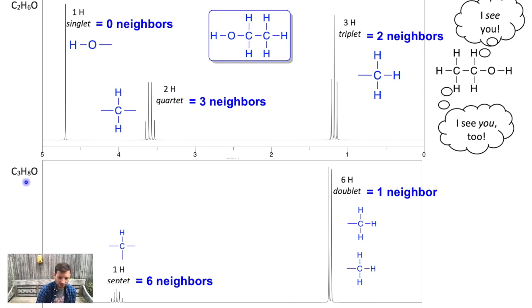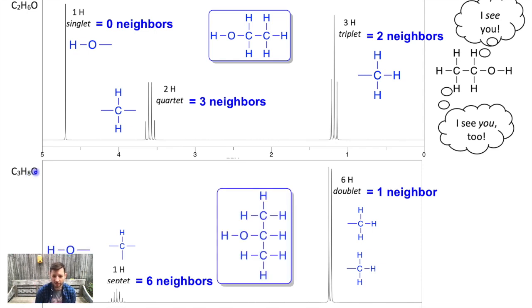What's off to the left here? Well, if I look at my molecular formula, which maybe I was able to get from mass spectrometry, I know that I've already got 7 of my 8 hydrogens, so there's 1 left. And there's an oxygen, so that must be an OH signal. And there's only one way for those to go together, and it looks like that. And that is indeed the isopropanol molecule, and that's its NMR.